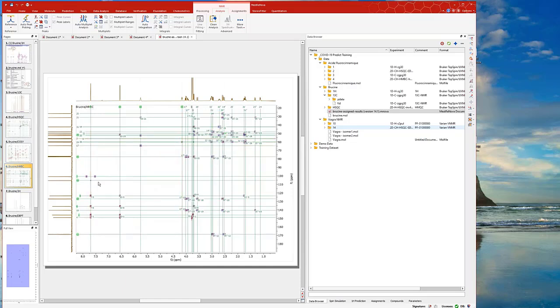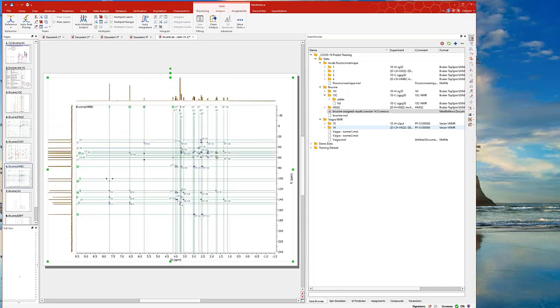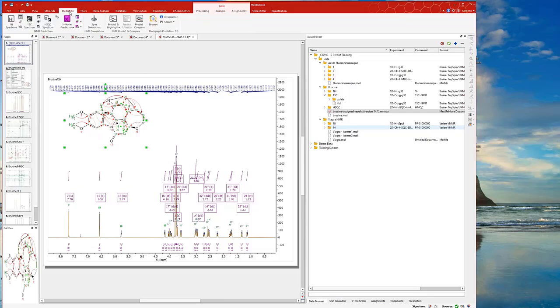You can do this in Mnova manually, and you will enjoy solving the jigsaw puzzle a lot, right? And some of those closed carbons can only be distinguished by looking at the HMBC, when you can see the key correlations are there, then you can distinguish that. Anyway, so I have the assignment of the carbons and the protons for every atom, right? So then I can use that to train the prediction model, the predictors, right?